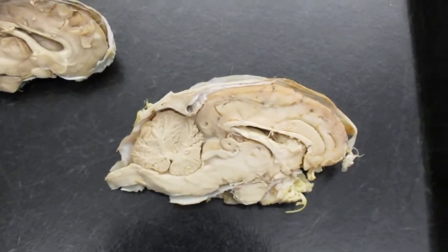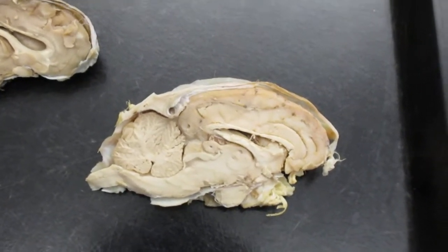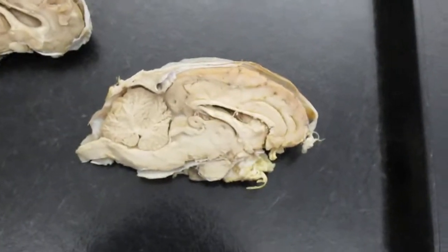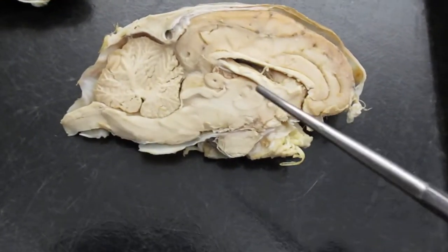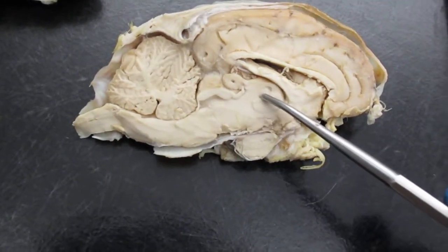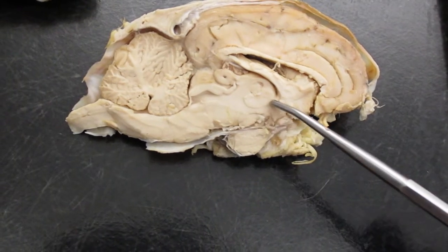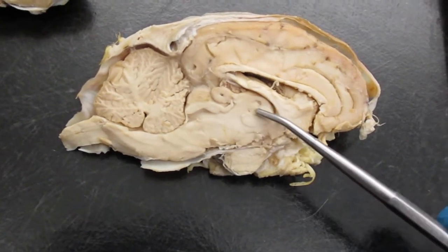Let's get started with the endocrine and reproductive system dissection. What we're looking at here is the sheep brain. So I want you to know some structures with the sheep brain. This ball-looking structure here that the probe is circling, that is the thalamus. This triangle structure here is your hypothalamus.